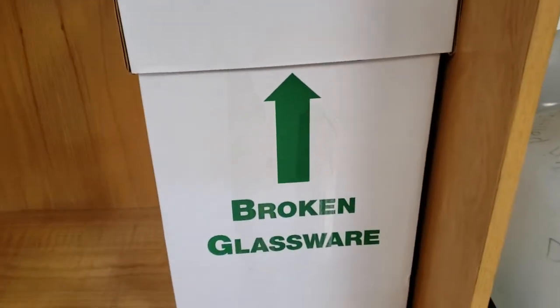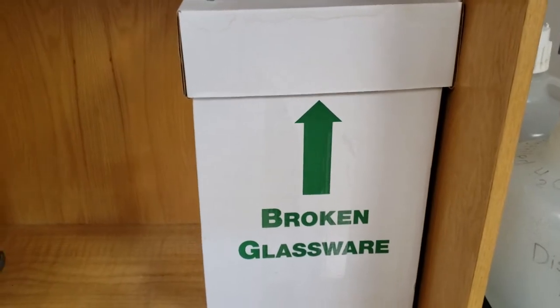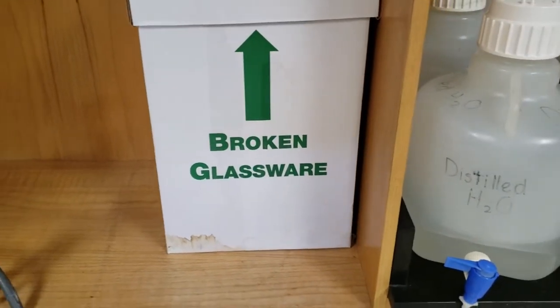We have a special place to put broken glass, which is very important. We don't put it in the trash can. We don't want to hurt our custodial workers who work so hard around here to make the place look good. So we'll just stop it in there. Things happen. Things get broken.